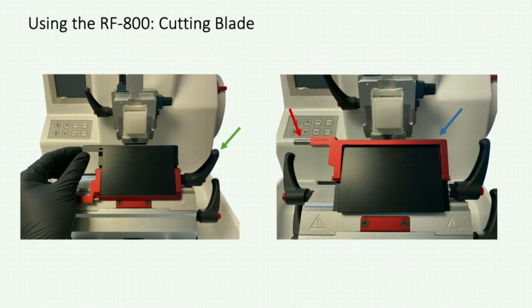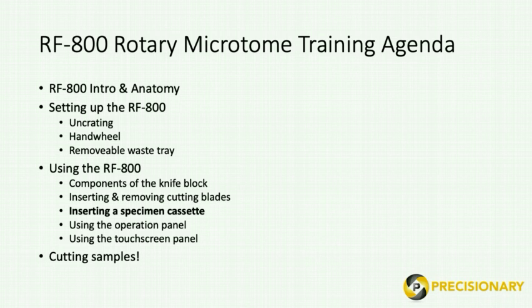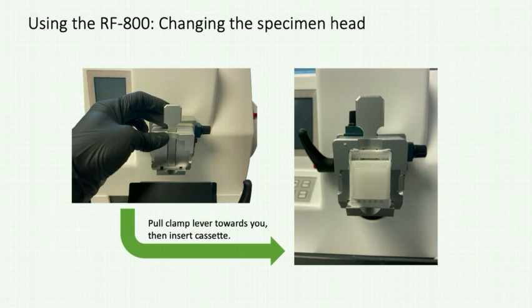When it's time to remove the cutting blade, loosen the cutting stage and push the blade ejector, here denoted by the red arrow. To insert a cutting sample, simply pull the specimen clamp lever towards you. Place your cassette inside and let the lever go. The cassette will be firmly held in place, ready for you to make cuts.